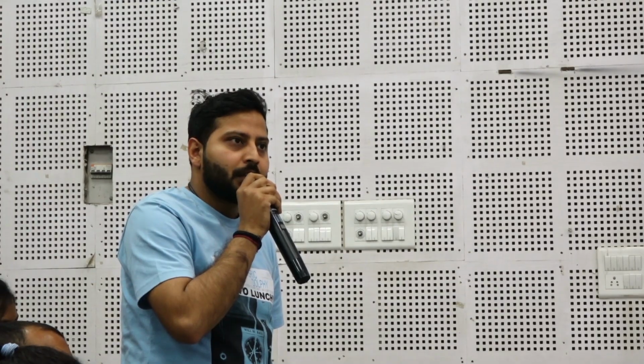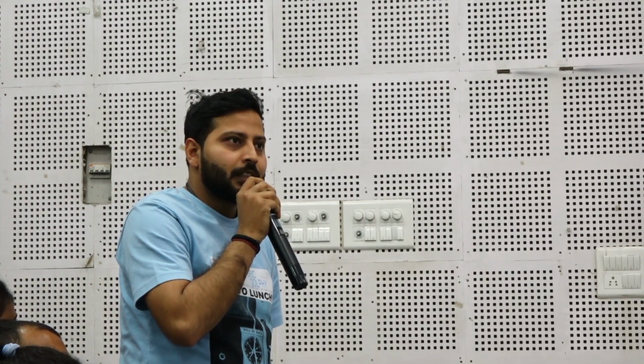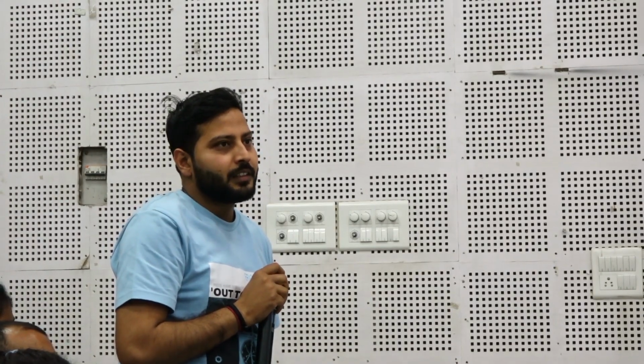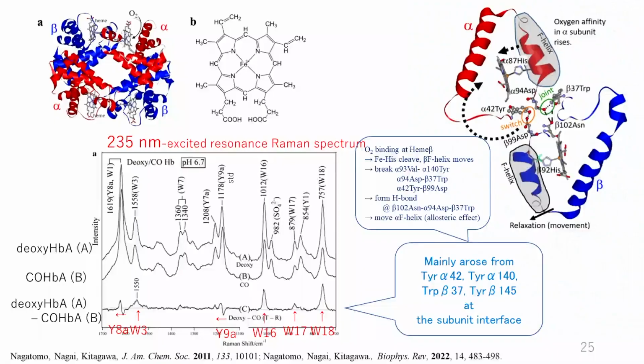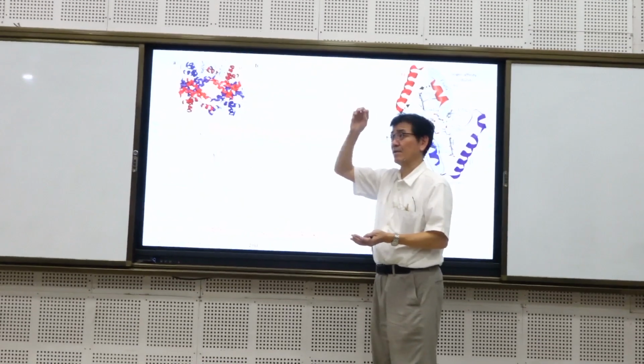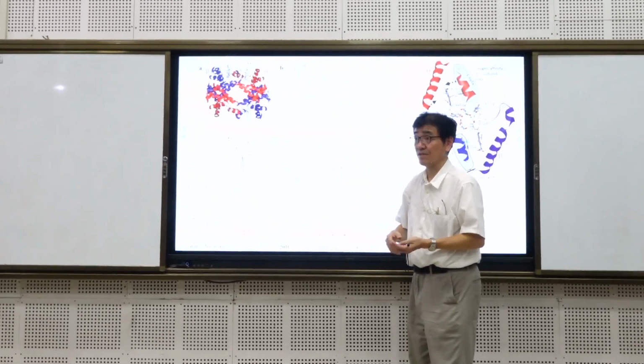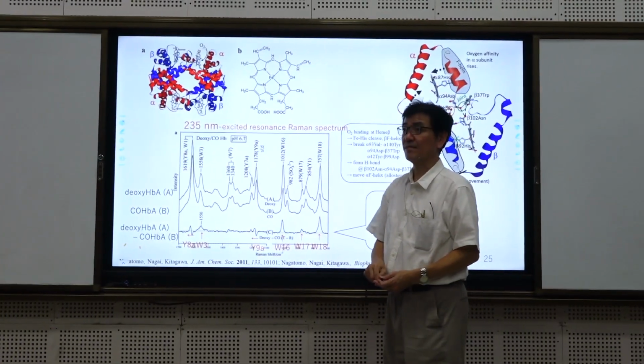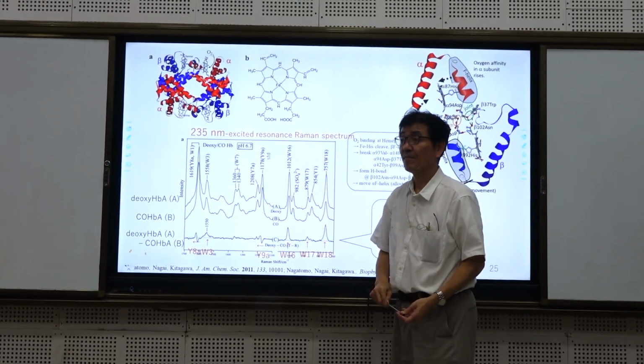As the excitation source is at the absorbance peak, is there no fluorescence background during the Raman? It depends. The resonance effect enhances the Raman signal, but it is accompanied by real excitation of the chromophore, and it may result in fluorescence emission. So in some cases, it happens.